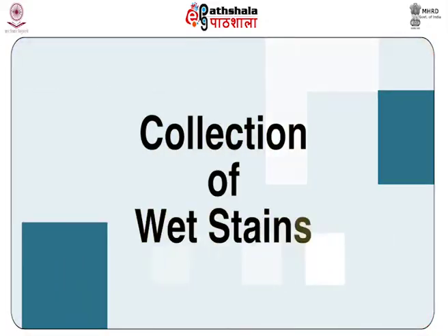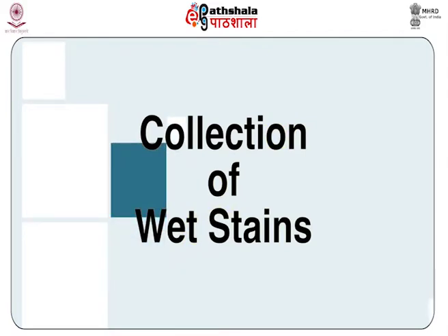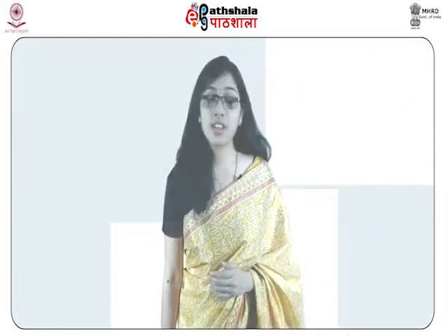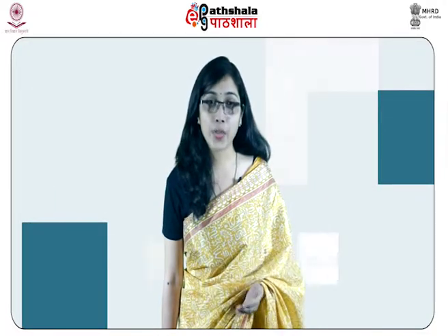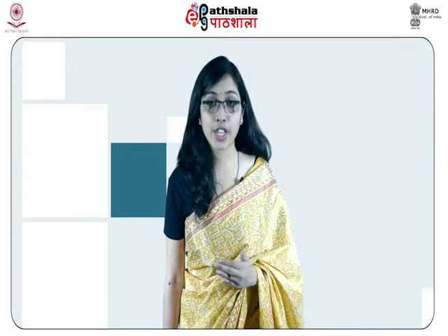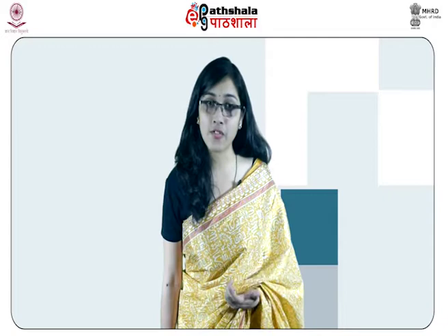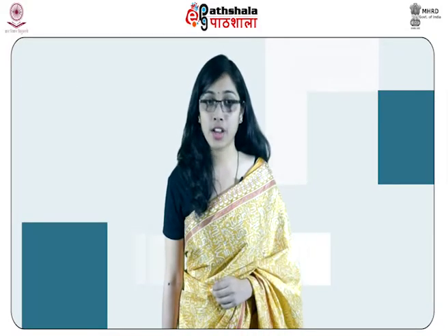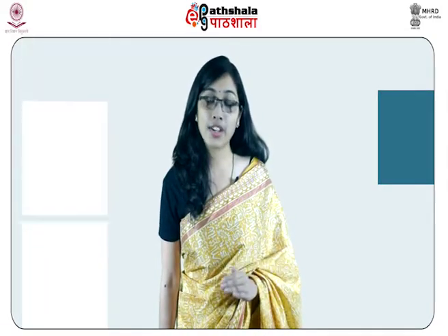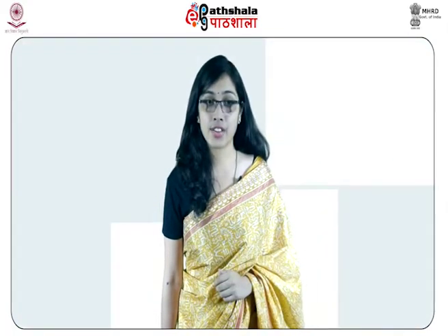Now, moving on to the collection of wet samples or wet stains. Sometimes wet stains are found on the scene of crime. The exact technique for the collection will depend upon the nature of the surface and the quantity of the blood. The following are the general guidelines that we will study here.